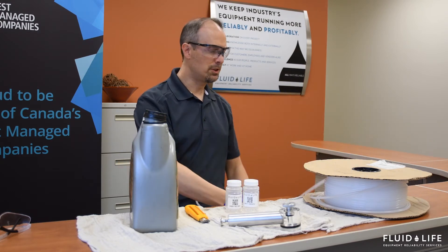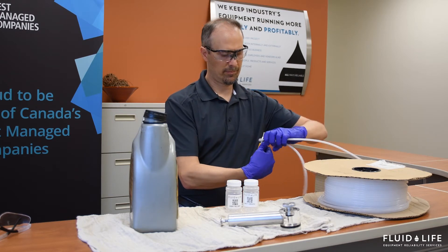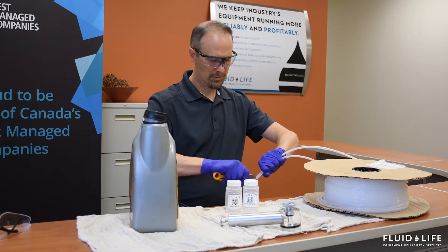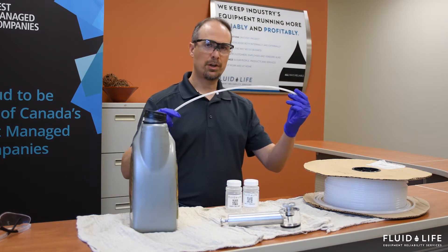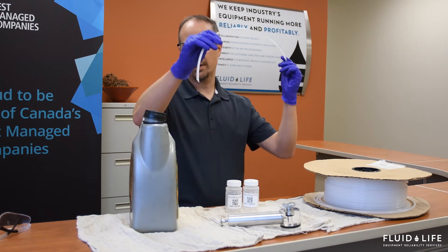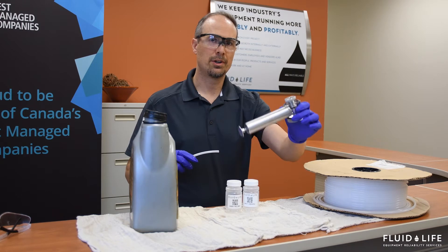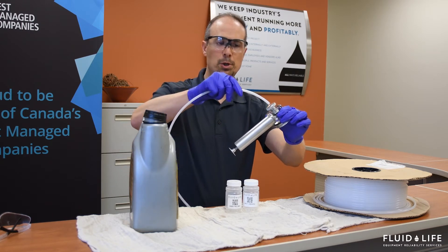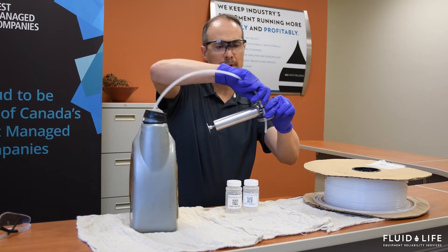Step one, what we're going to do is we're going to collect some tubing. You want to make sure your tubing is long enough that it can extend down into the reservoir and give you a representative sample. What we're going to do is we're going to insert this tube into the top of the pump and we're going to thread this lock nut.